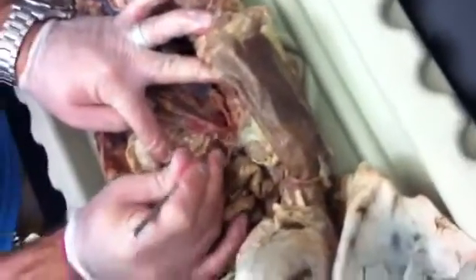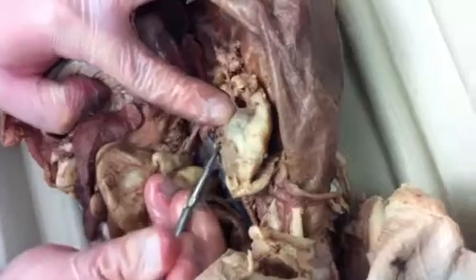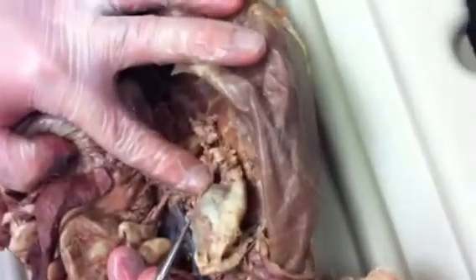When we cross through the diaphragm, we're now the abdominal aorta. We go from thoracic aorta to abdominal. Celiac artery, superior mesenteric. We follow it down. It'll make some branches. Usually just find the kidney, kind of search around for the red vessels. There it is right there. The red vessel going to the kidney is the renal artery.